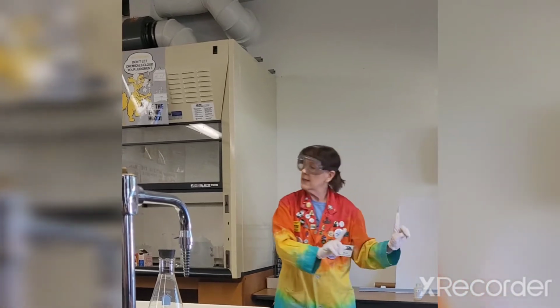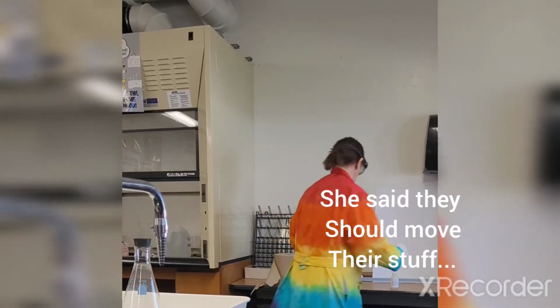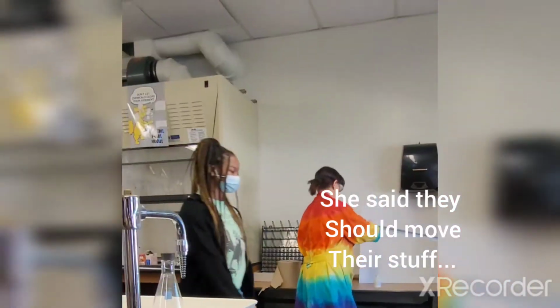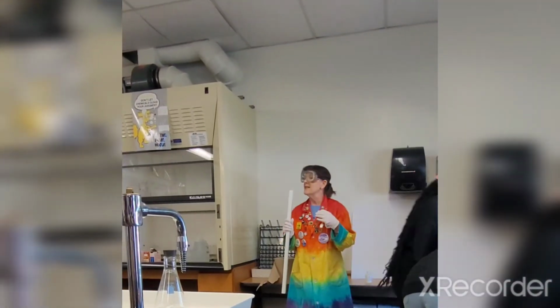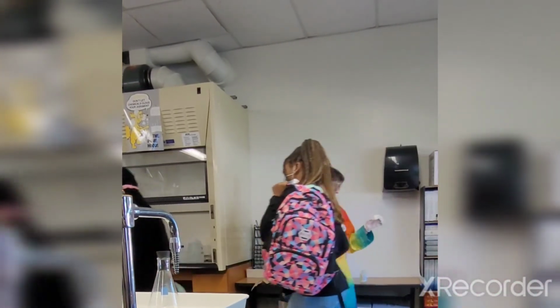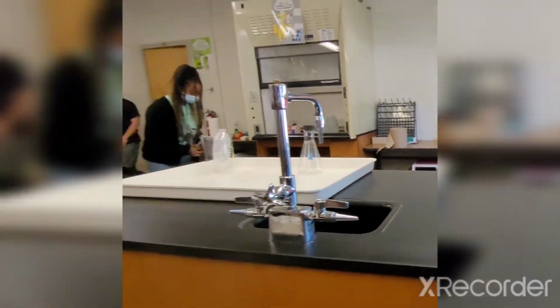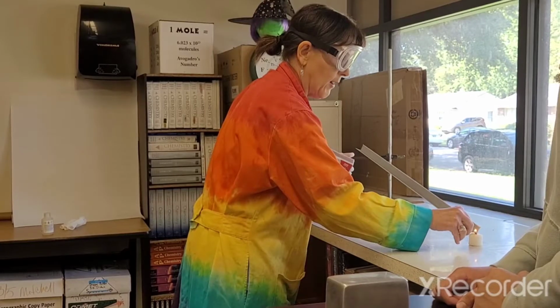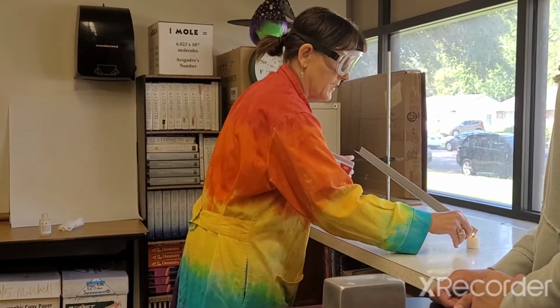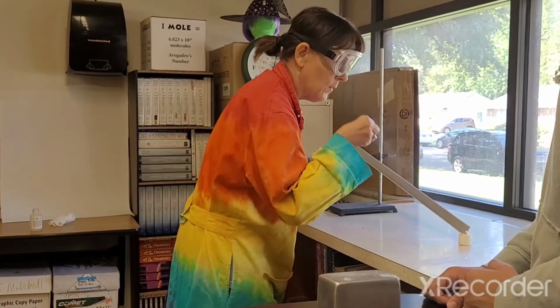Okay, ladies, you might want to move. We're going to try to set the vapor on fire in a safe way, right? In a safe way. Now, it worked just a moment ago, I'll get it during my last class, but it took a minute. So let's see if I can get it set up first. Back up to where I was pouring from. We'll see if it works. Oh, come on now. There we go.